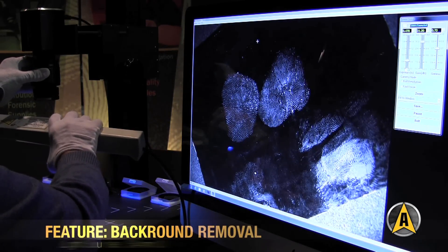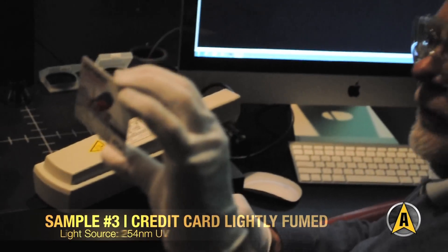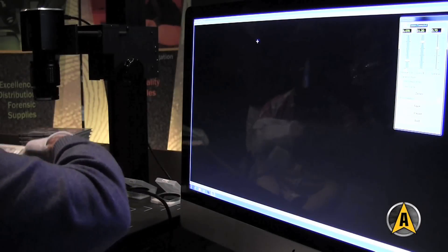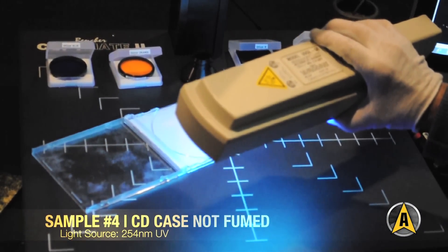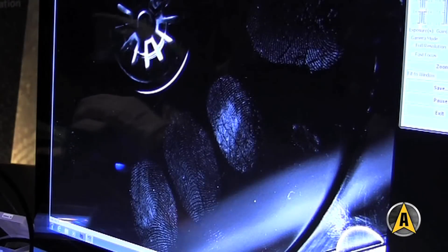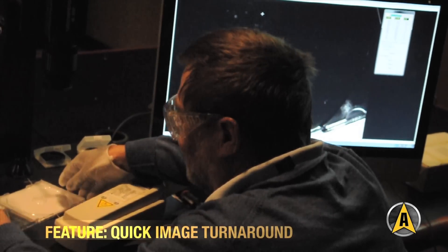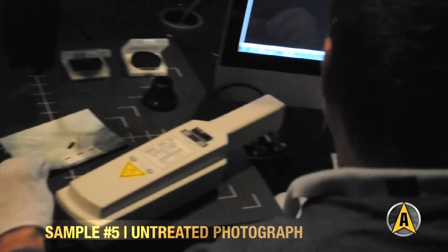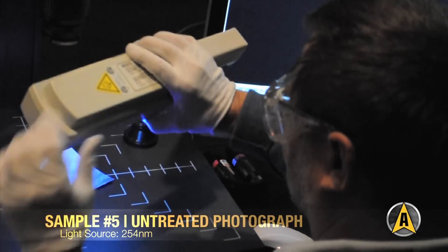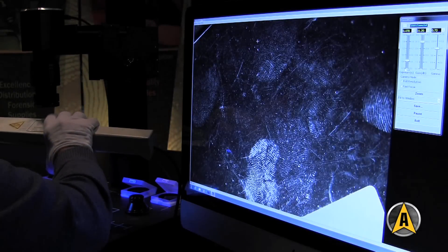Another thing you'll notice at 254 nanometer UV is the background pattern goes completely white. It's got that really nasty pattern in the background, and as you look, it's all over the thing. You can see there's latents all over this photograph, and the background goes away.